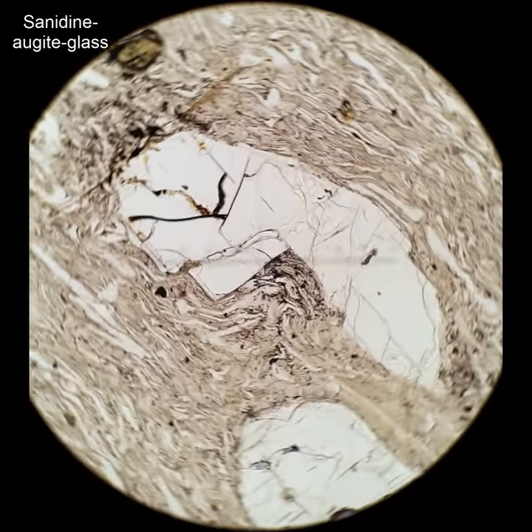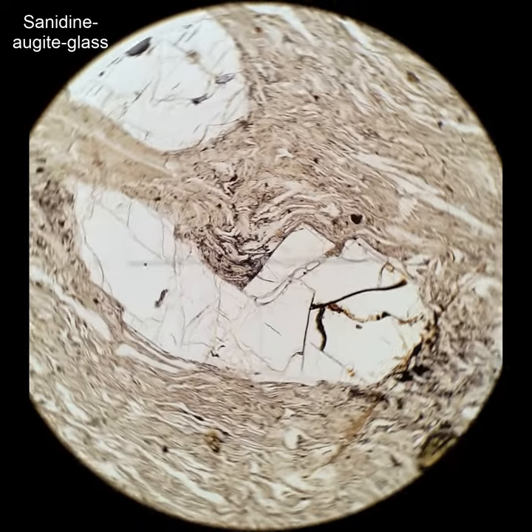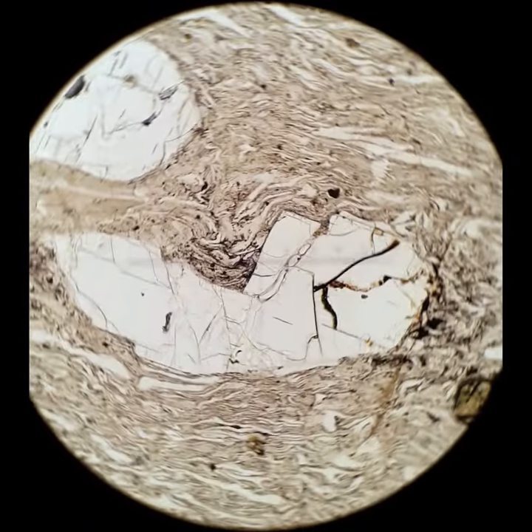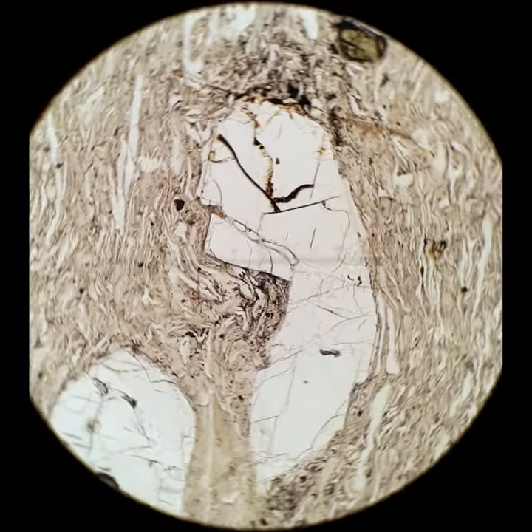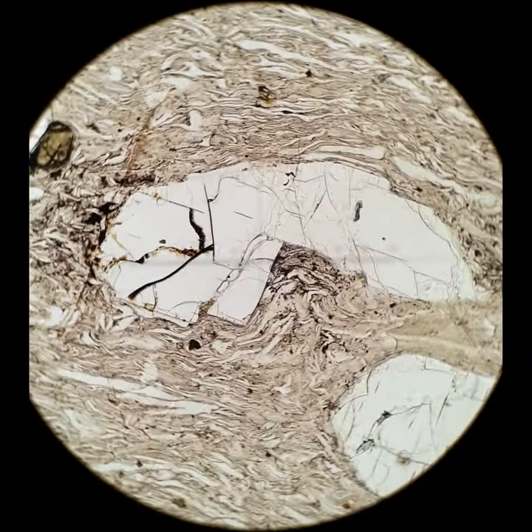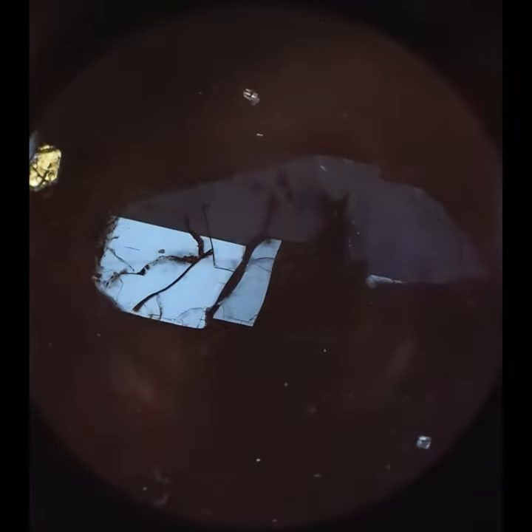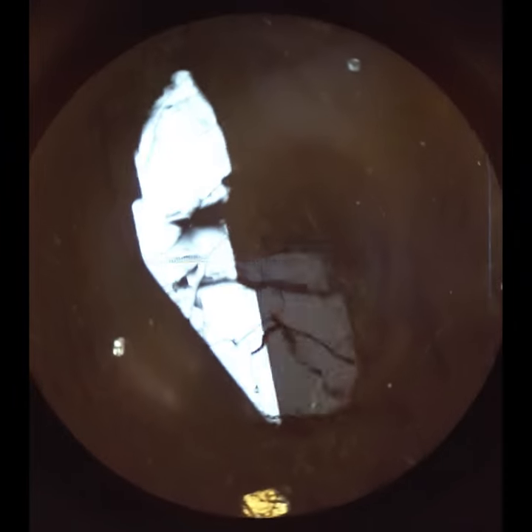And last, I'm not very good at identifying minerals in volcanic rocks, but I'm pretty sure that this is a high-temperature K-feldspar called sanidine. Same kind of deal, low relief. These are rapidly cooled, so you do not see any kind of exsolution. But commonly, K-feldspar will have a single twin running down the center called a Carlsbad twin, and that's one of the reasons I'm pretty sure this is a K-feldspar.